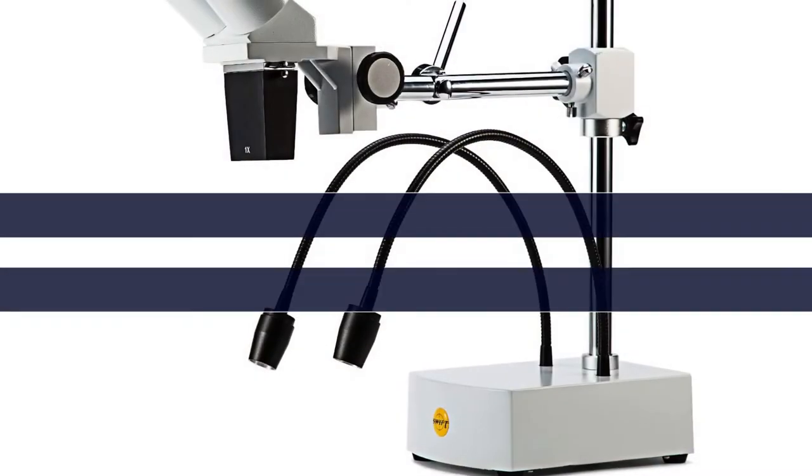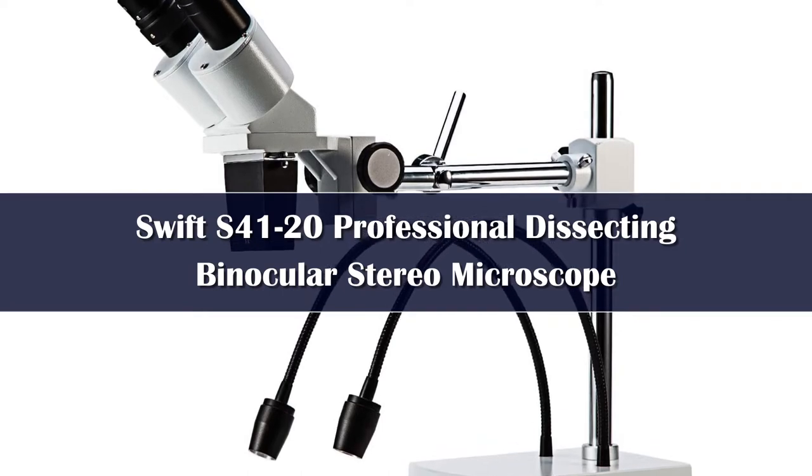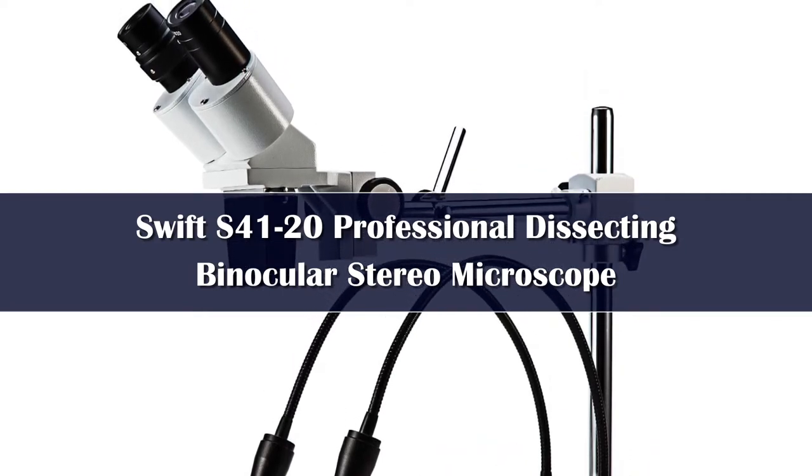Number 5: Dual Gooseneck Light. The flexible gooseneck LED light shines down onto objects for the observation of surface details and fine structures.